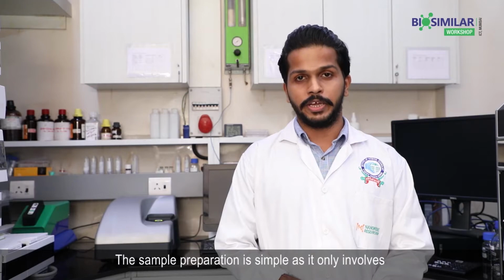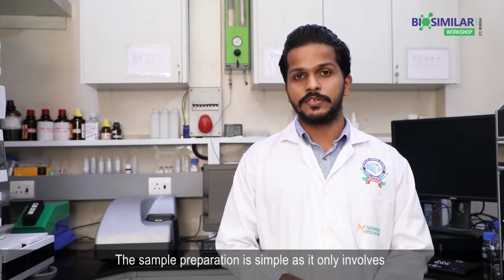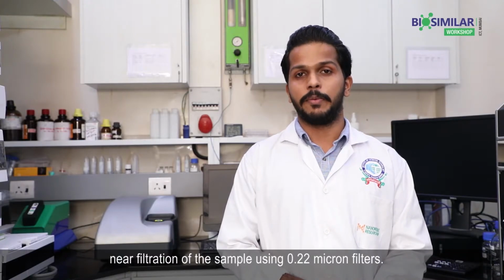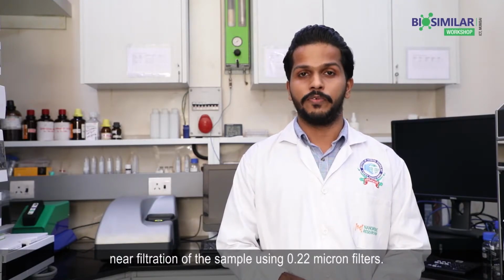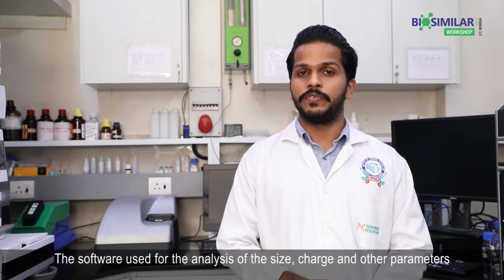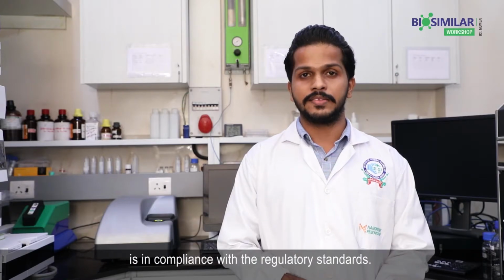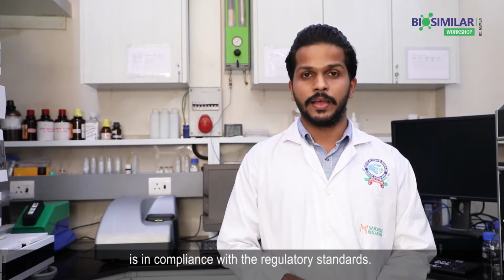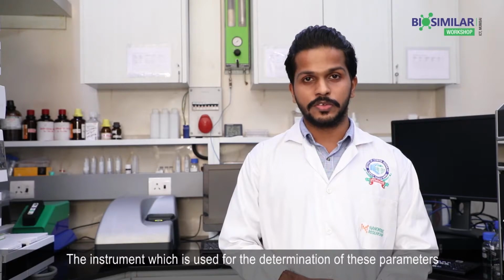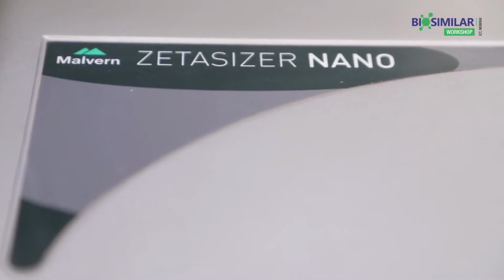The sample preparation is simple, as it only involves mere filtration of the sample using 0.22 micron filters. The software used for the analysis of the size, charge and other parameters is in compliance with the regulatory standards. The instrument which is used for the determination of these parameters is the Malvern Panalytical Zetasizer Nano ZSP.